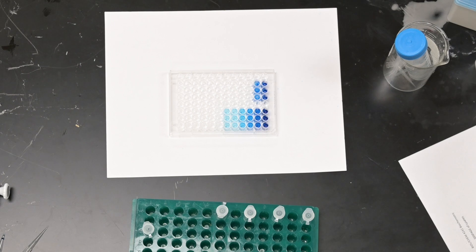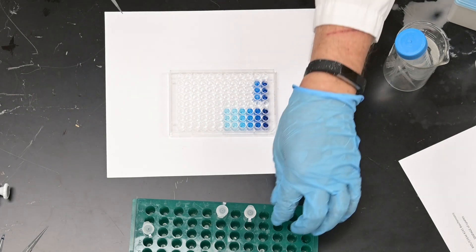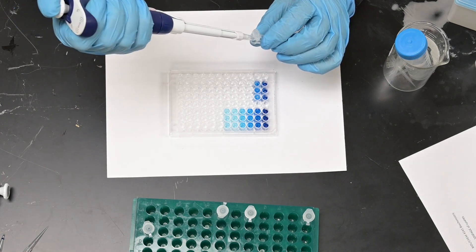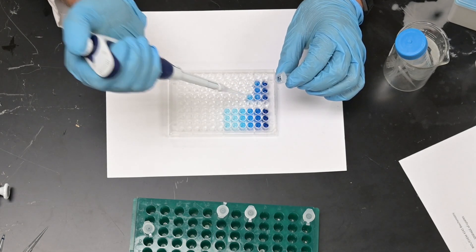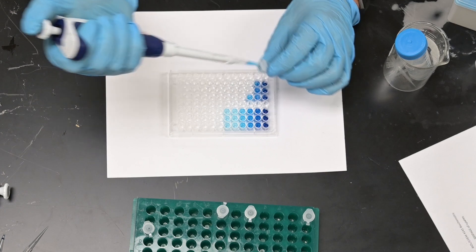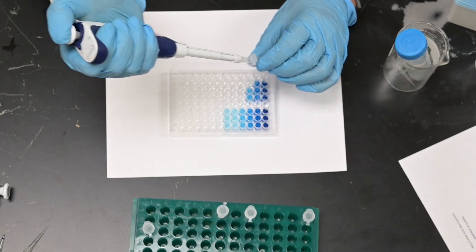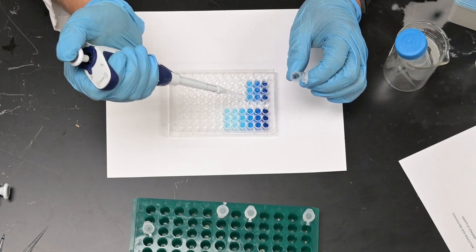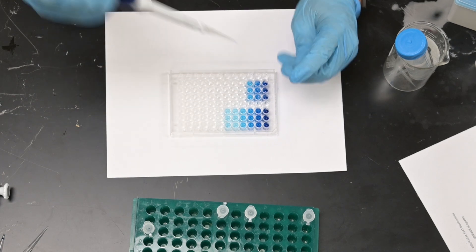Then I will go through and now the one-fourth diluted, and add that to E3, F3, and G3.